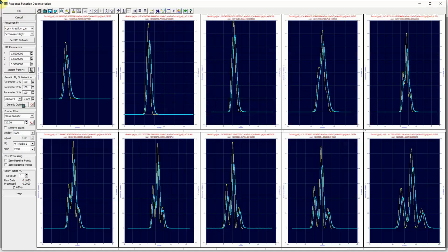Now here we're going to have to be a little bit careful on these 80, 90, 100 millimeter lengths. You can see one of these points has been pulled to the baseline. Both of these have been pulled quite close, and here we're actually on the baseline. So the genetic algorithm tries to maximize the baseline. In this particular case, for these three data sets, it may have over deconvolved to try to maximize the baseline by producing this baseline resolved state when that isn't what the true case would be with the IRF removed.